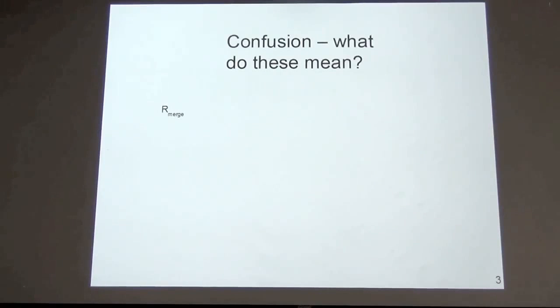To start with the worst of these, it is R merge. I've just gone through the literature and collected some of them and put them into this slide, though they have no real relation to each other here. To make sense of all of these and all the others that are not mentioned here is a difficult task.